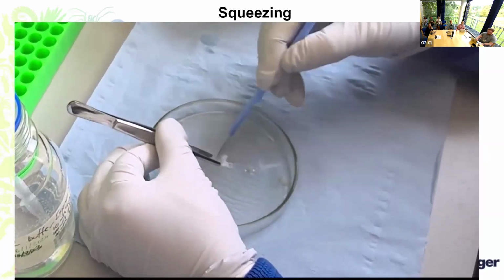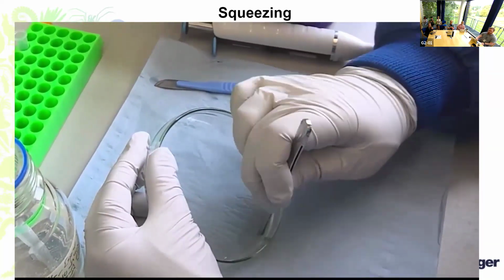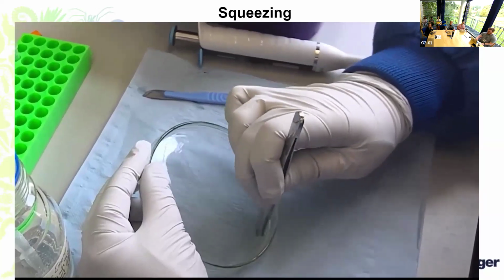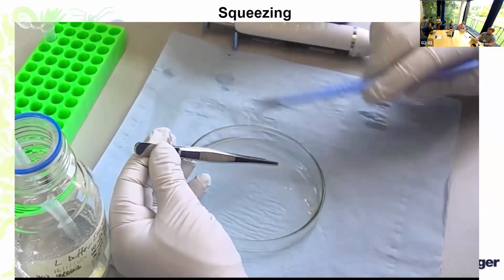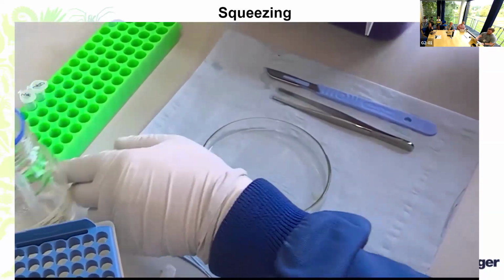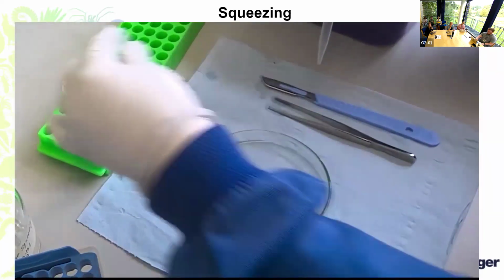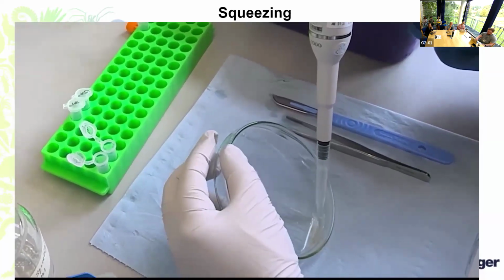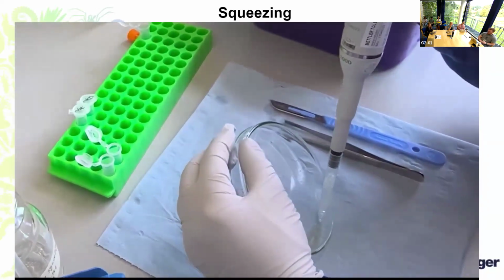This video has been sped up, but I can spend up to 5 to 10 minutes per sponge, depending on how difficult the tissue is to break up and fragment. Once I'm happy that the sample has been broken up and I have cells within my lysis buffer, I will then get 2 clean Eppendorf tubes, and I will aspirate off just the lysis buffer solution into 2 clean Eppendorf tubes. When aspirating, I'm taking care only to try to take the lysis buffer if possible and not to take the tissue with me at the same time.